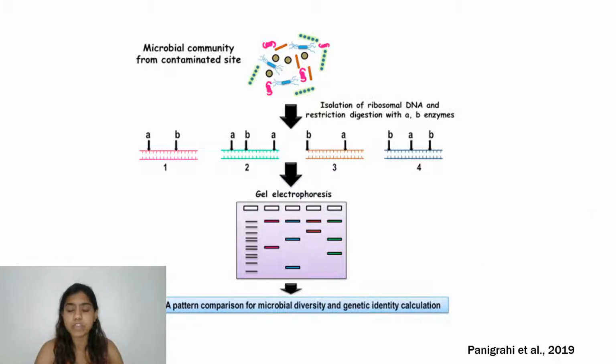So what is a gel electrophoresis? Here it's a horizontal gel electrophoresis using agarose. Agarose crystallizes to form pores, and a tight network along with pores. Depending on the percentage of agarose used, the pore size will change, and when the DNA passes through the agarose, depending on the molecular weight of the DNA molecule, which is in turn decided by the sequence of the DNA molecule that we are running on the gel, they will separate at different places.